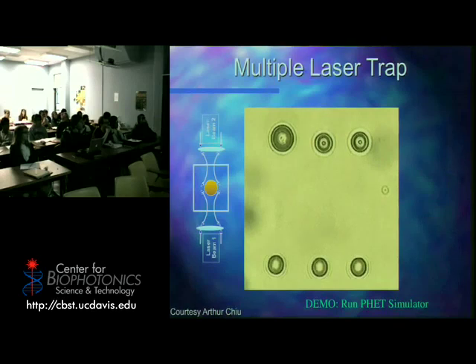So this is a movie where they've taken different laser beams and they are able to focus them through lenses onto small beads in this case, but these could be cells, it doesn't really matter. And you can use the laser as a tractor beam. You can make the laser effectively trap something, and you can control how it moves. Okay, so this is 6 of these things here. I'll play it one more time.